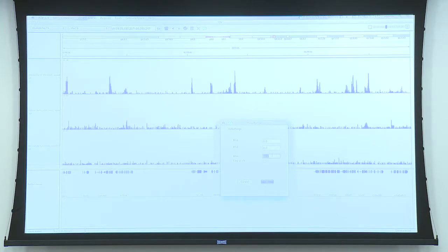In general, you also want to make sure that the read depth is the same. But again, this is where the field of epigenomics is still trying to find the best ways to normalize. But for our case, let's imagine that something like 15 is a good maximum for setting the threshold. So it's a matter of signal to noise.